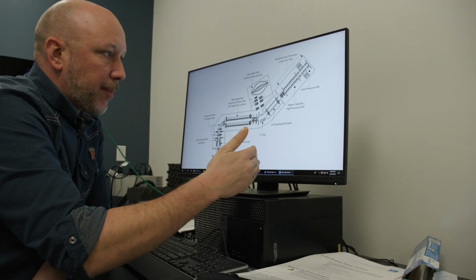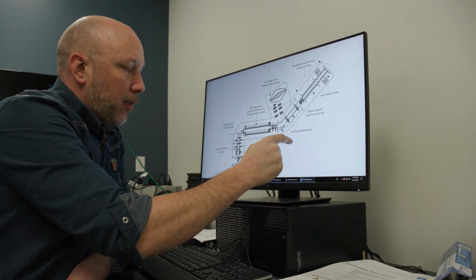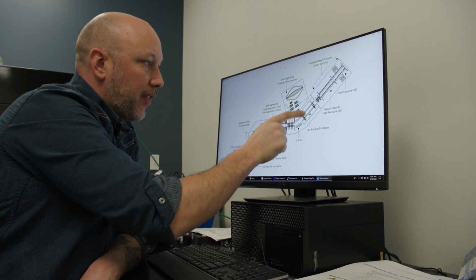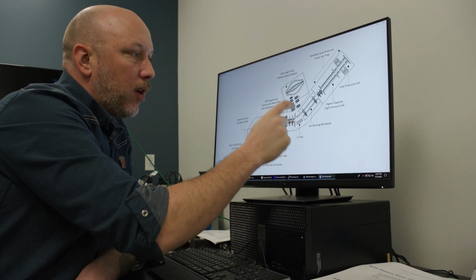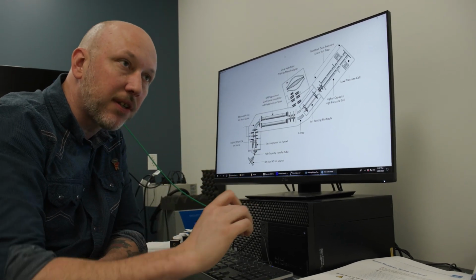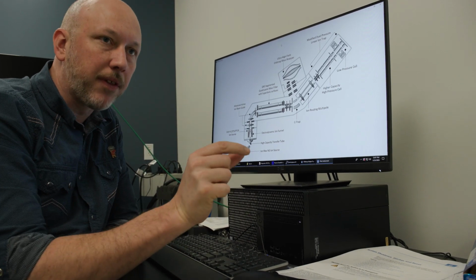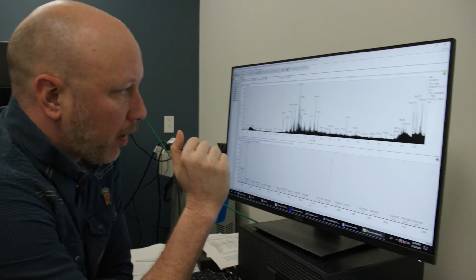You know, our glycopeptides are not very common, so we spend a lot of time doing the really efficient fragmentation and doing it fast. And then if we see a diagnostic ion for a glycopeptide, we then take the time to go into the ion trap and do the electron transfer dissociation, because it's not quite as efficient and it's not quite as fast, but it's really important for nailing down exactly where that glycosylation site was. Okay, so I'll show you what a glycopeptide run looks like.